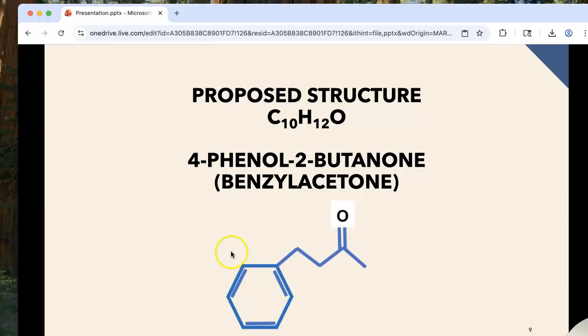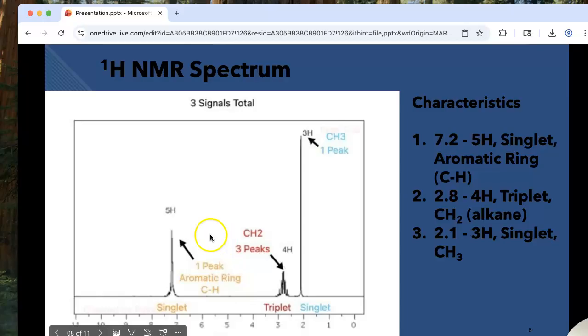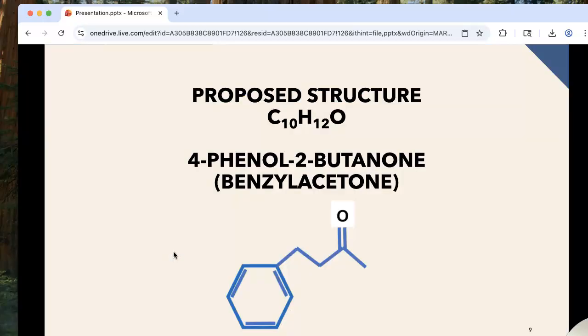And then the last hydrogens, well, right here, the last 5 hydrogens on this page have a singlet. This one confused me at first because I thought they would have a doublet, and then I realized that they have a singlet because they are equivalent in their attachments and in their chemical structures. So that was also a big indicator for an aromatic ring. Here's the ketone. Like I said earlier, it was a ketone, not an aldehyde.